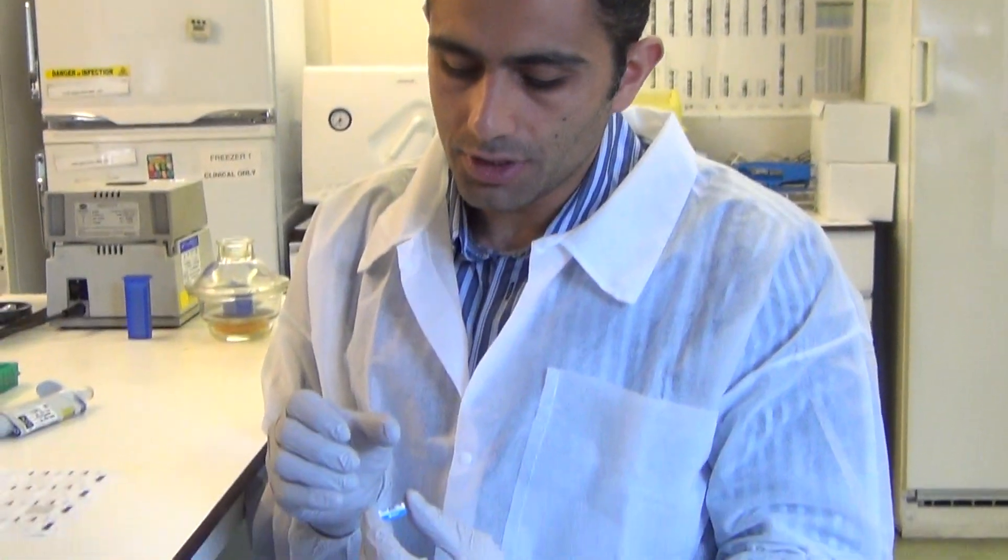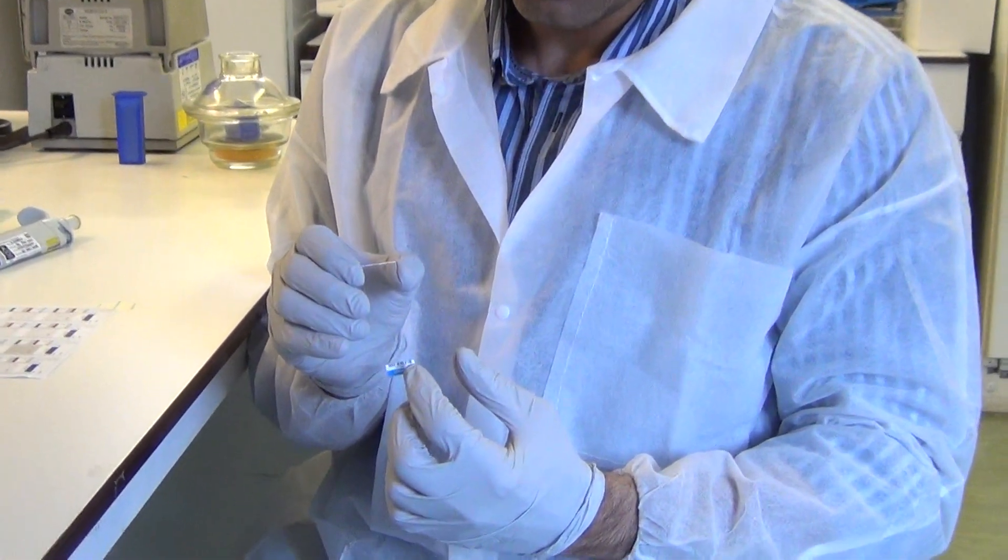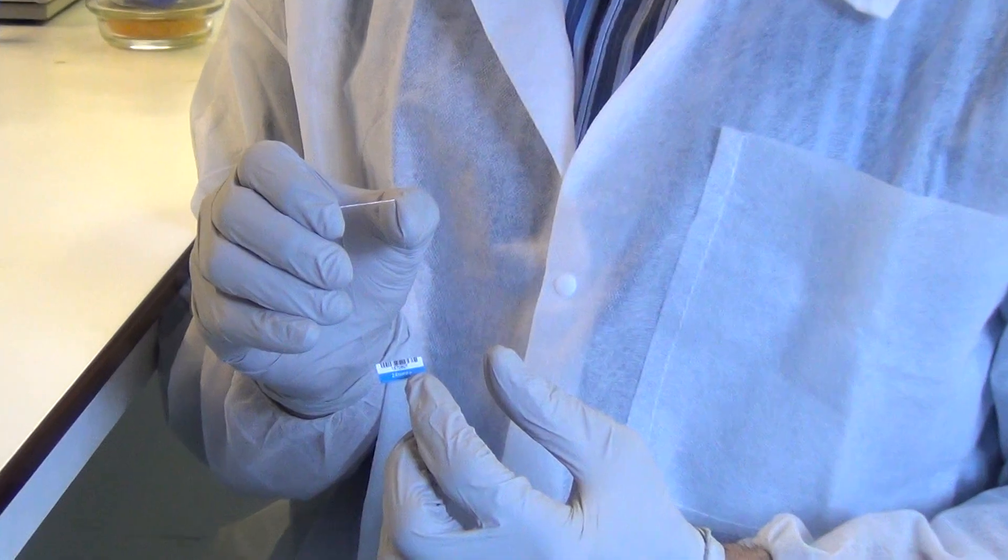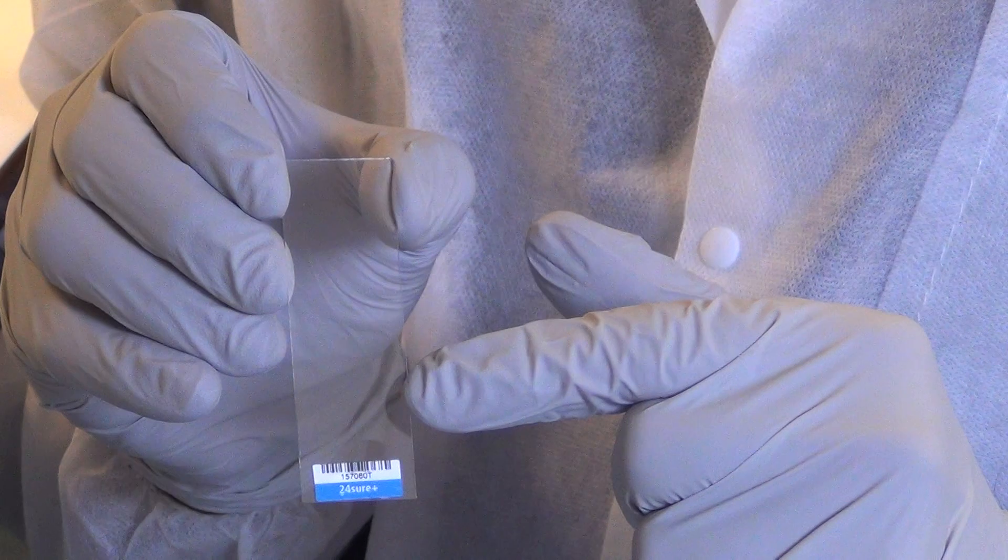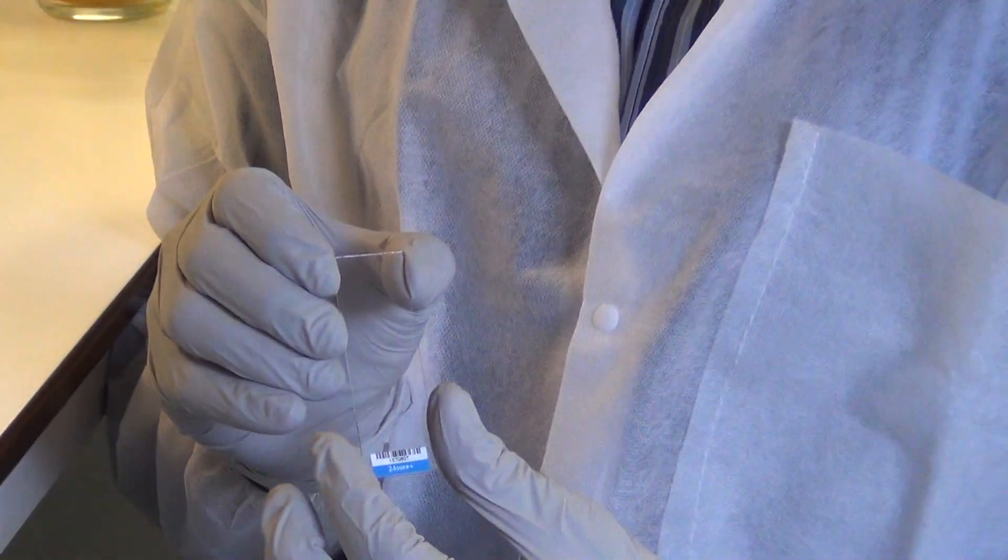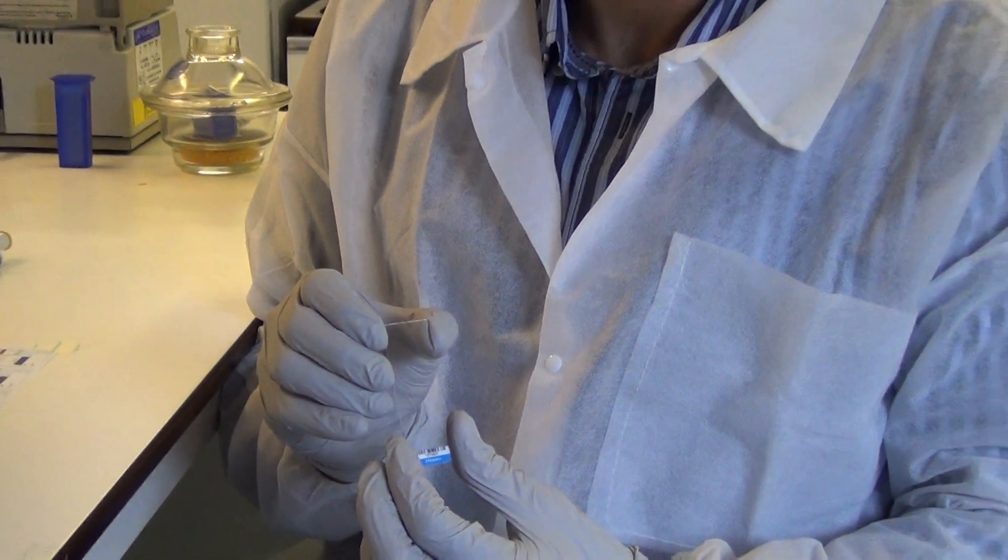In this step, the resuspended labeled products are loaded onto the array slides. On this barcoded slide, there are two arrays printed at the top and bottom positions. Care must be taken when dispensing the sample to prevent the formation of air bubbles, which would interfere with the hybridization.